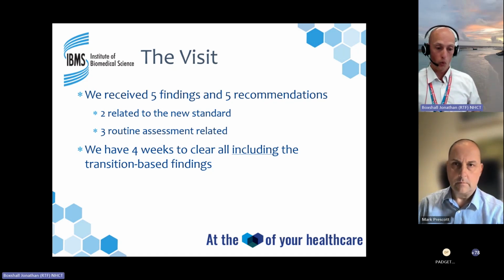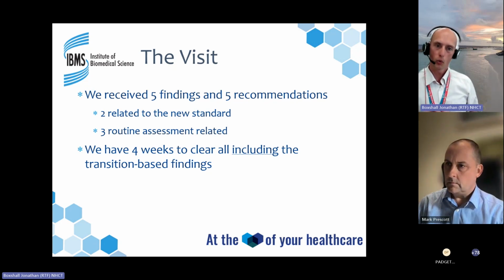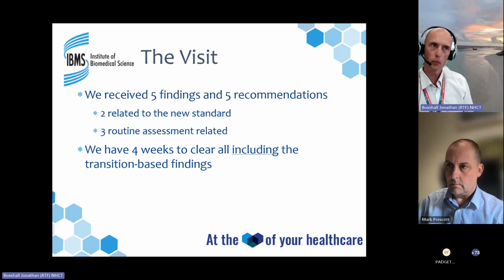So we may get a finding to say, oh, you haven't done something. So what you do is you go, all right, well, I'll fix that something, and that's it. But what some are not very good at is then, under cause and extent, going, well, how else could that be affected, and looking at that. It's effectively almost like having to audit.